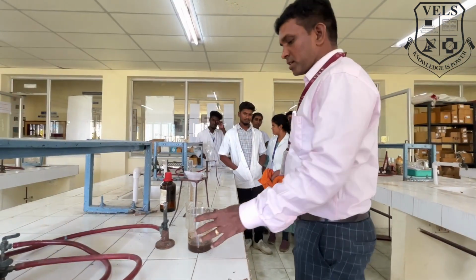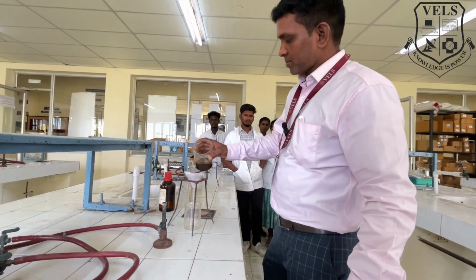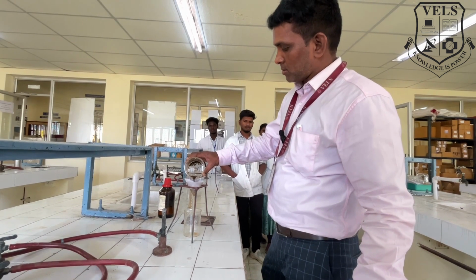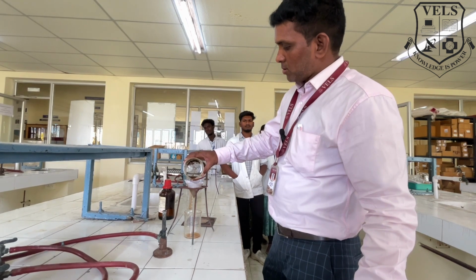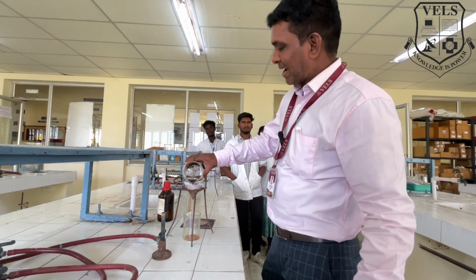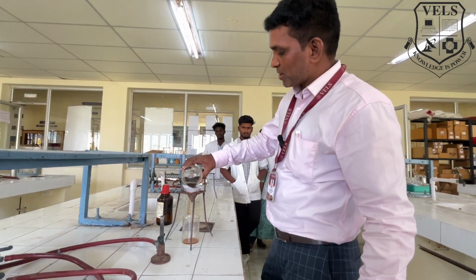After 2 hours of heating, the next step is to filter. In this extract we have both caffeine and tannin, so remove all the junk particles by the filtration process.